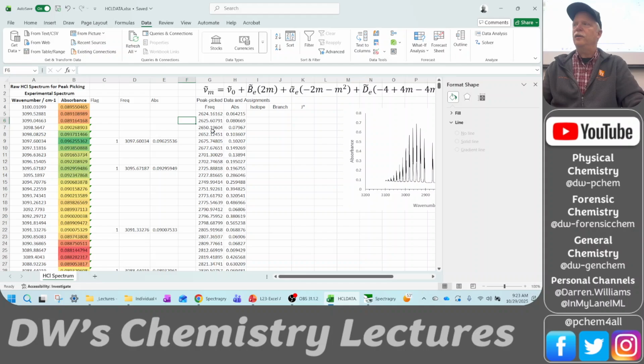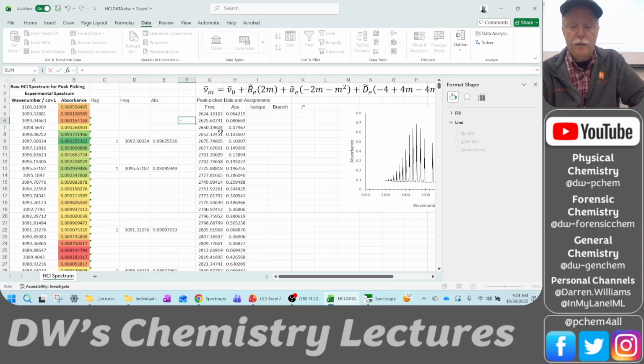All right, I want to take the difference between all of these to see if we have a uniform difference. The uniform difference should be 2 times the rotational constant, right? These are rovibrational lines. There'll be some small differences because of the HCl 35/37 isotopes, so they should alternate. Big difference, tiny difference, big difference, tiny difference. So let's see what we get.